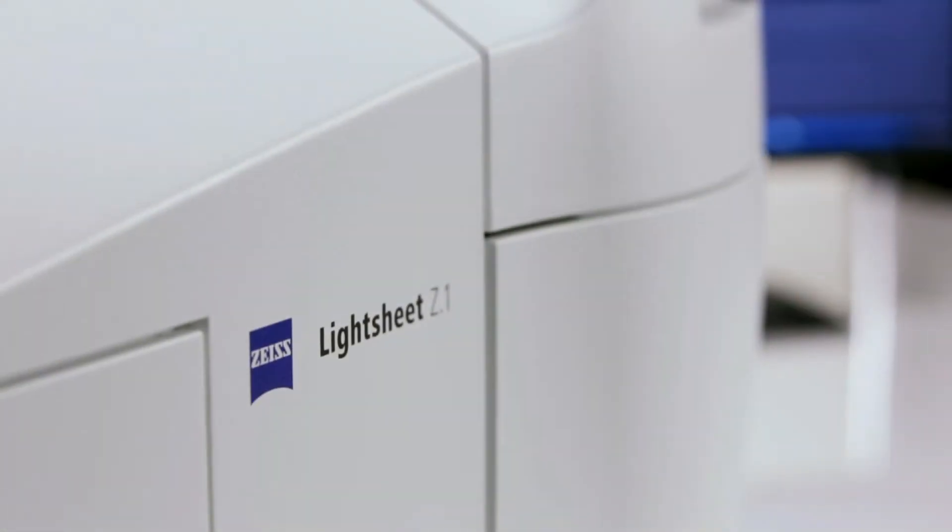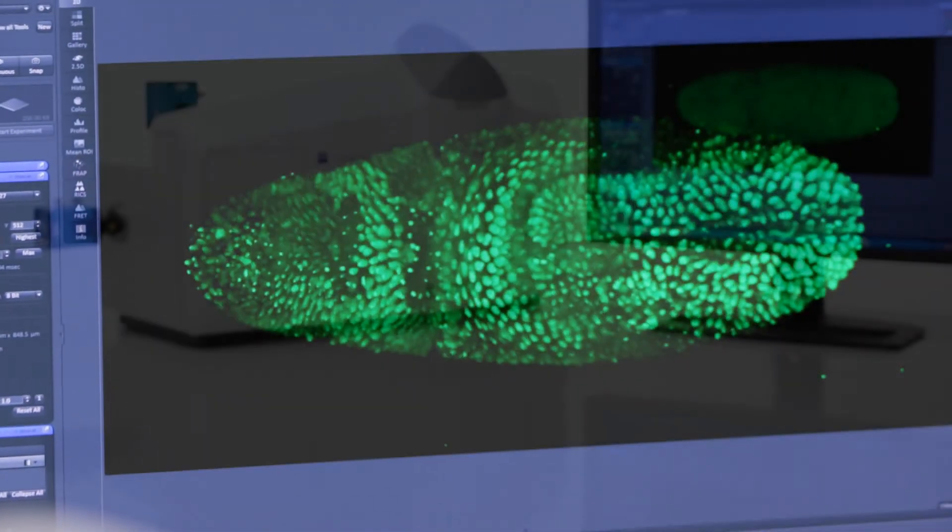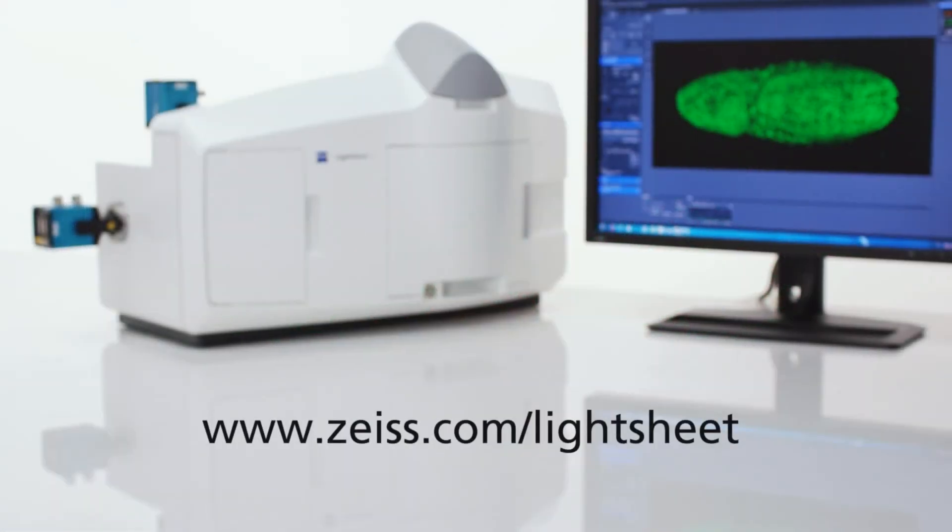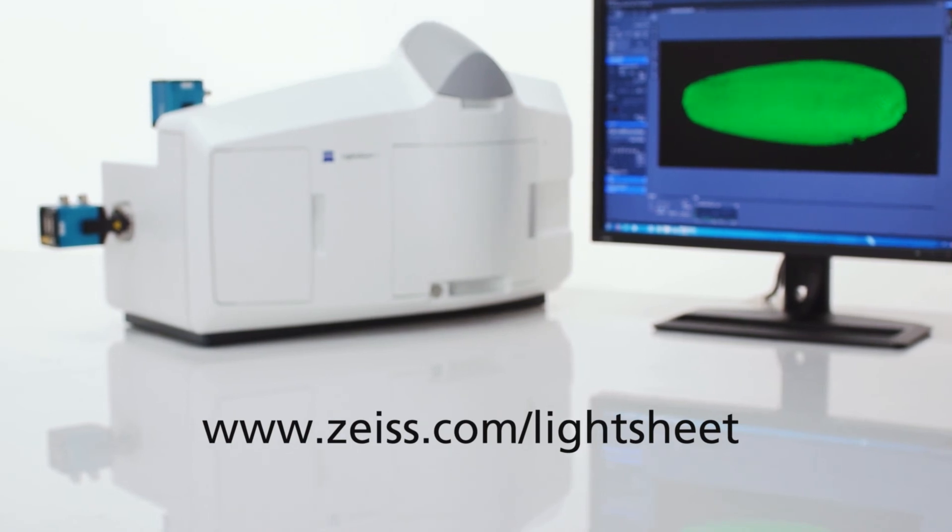Your sample is now ready for imaging with LightSheet Z1. For further information, visit our website.